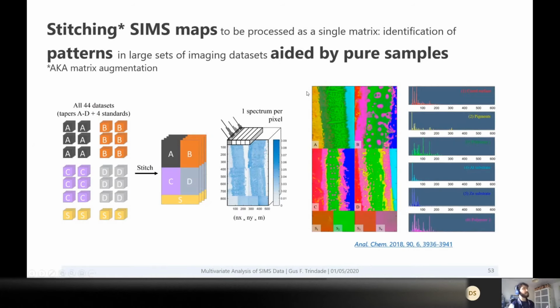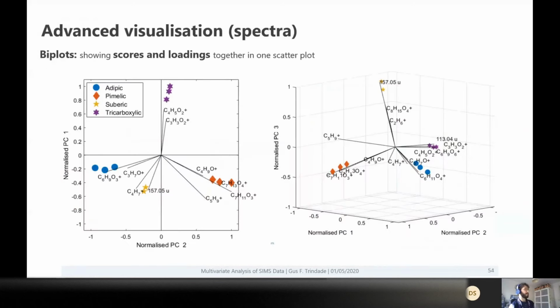So these are all the pre-processing. I would just talk a little bit about the post-processing, things you do after you get PCA and NMF. And these are all related to visualization, because what you get is a matrix with the numbers, and there are good ways to show these results. Even though the dimensionality is reduced, you still have to show it in a way that's easy to explain.